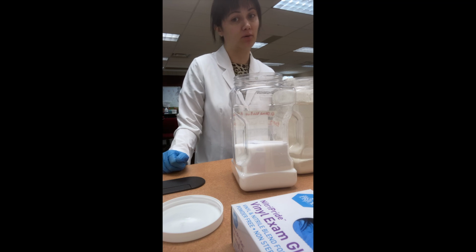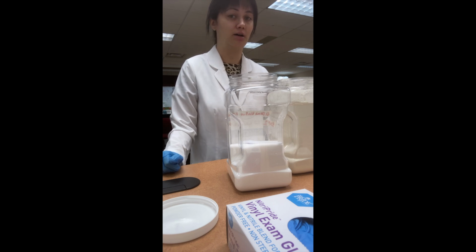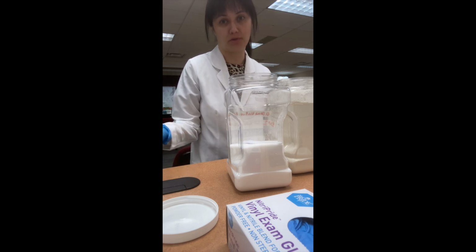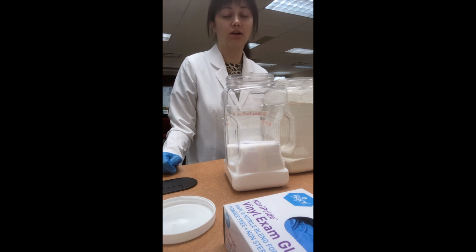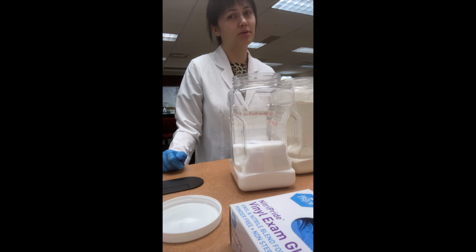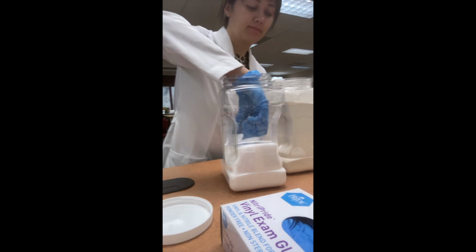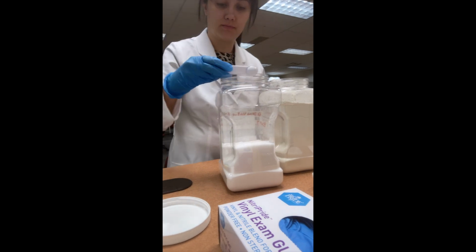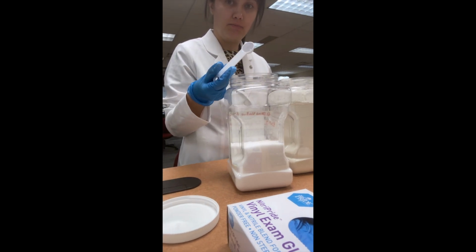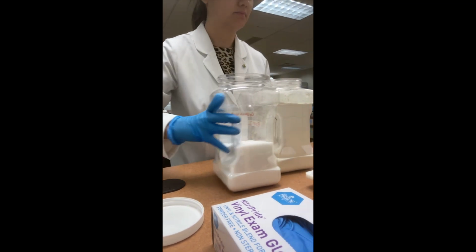In pharmacy, we always measure solids using grams. We don't measure using liquid units like you often do if you're baking. Just to make it easier for you to scoop, I told you it would be about 5 milliliters or 1 teaspoon. But we're going to weigh it out just to make sure everything is accurate.